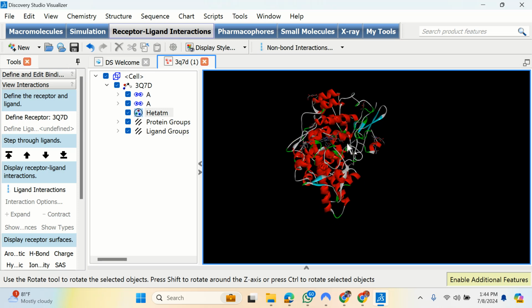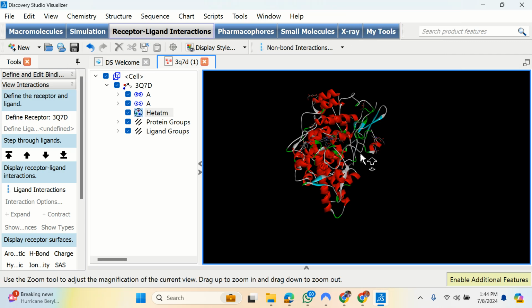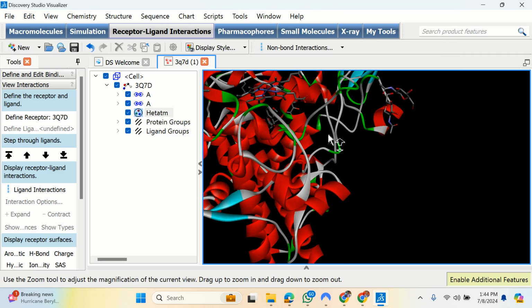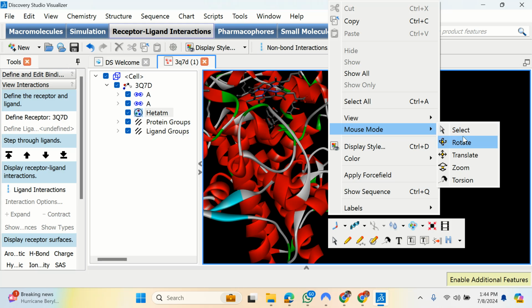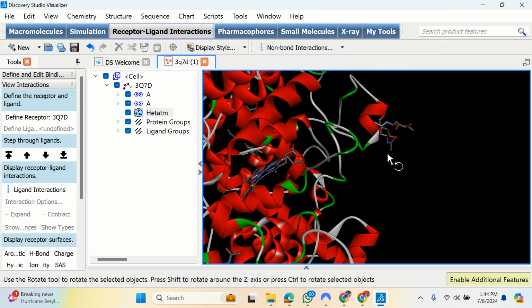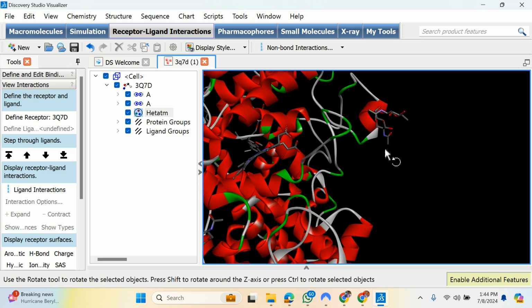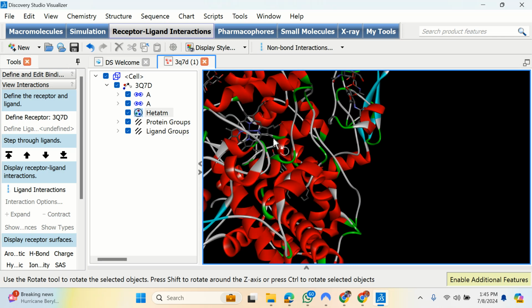This is what we call, let me zoom this. I'll go to mode and then I'll go to zoom. Let me change this back to the base. You can see the stress because I don't have a mouse, right? Look at the heme group. There is what we call the heme group in peroxidase catalyzing reactions. This is exactly how the heme group looks like.